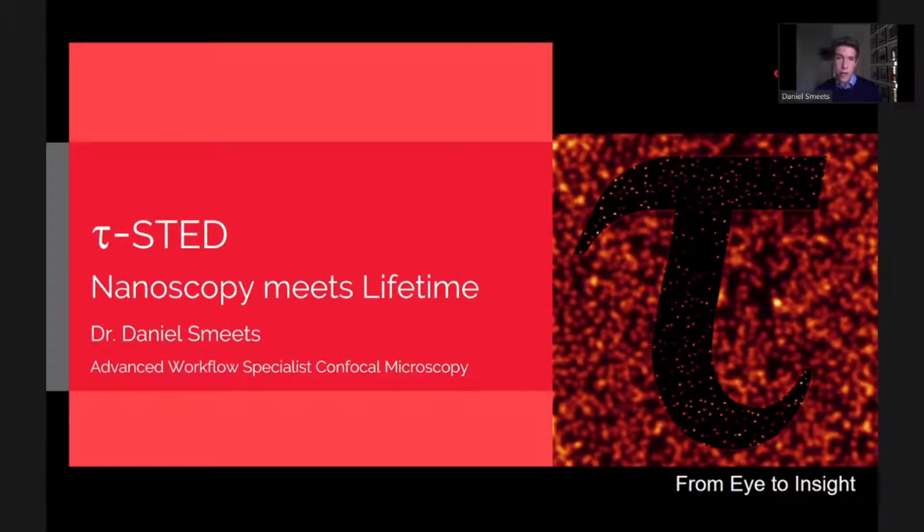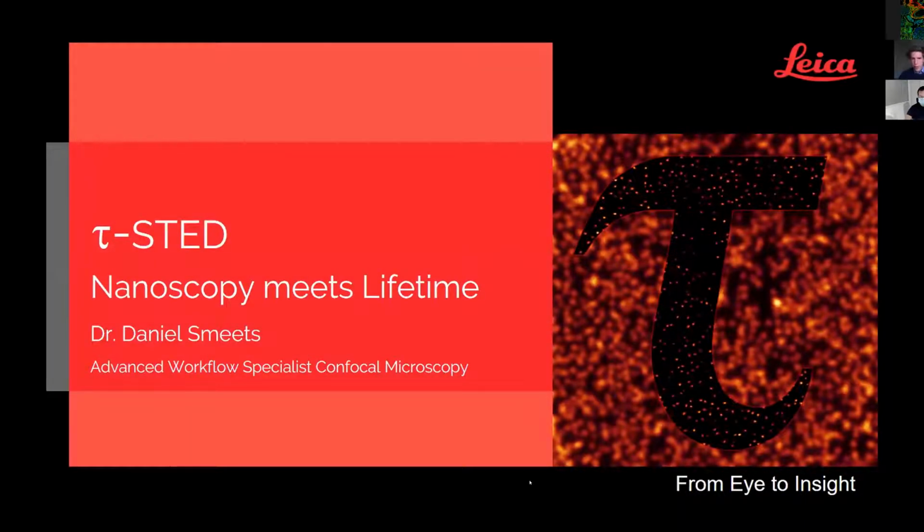Until now, you have heard quite a lot of applications and ideas of how you could make use of lifetime information in different areas of microscopy. Now in this session, I would like to give you a little bit of a different spin on the lifetime topic, and show you, as Steffen has nicely explained, how you can make use of that in STED microscopy.